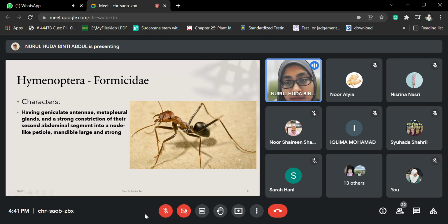But if you look here, kamu nampak dia punya coxa, they have very enlarged coxa compared to other segments of the leg. Yang lain ni macam slender, yang trochanter mungkin a bit smaller here, but they have very enlarged coxa for this specimen lah, for this gambar.